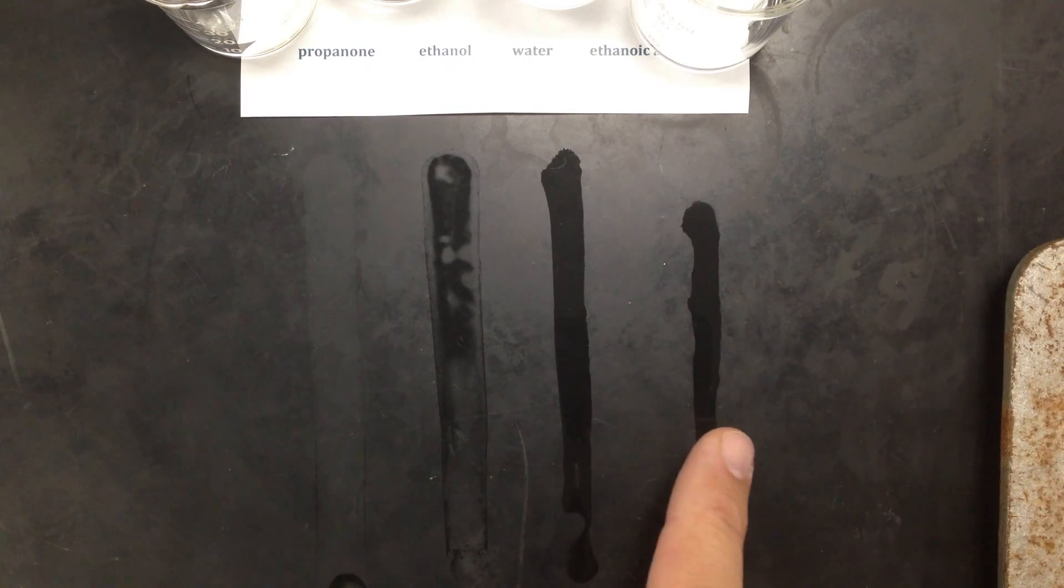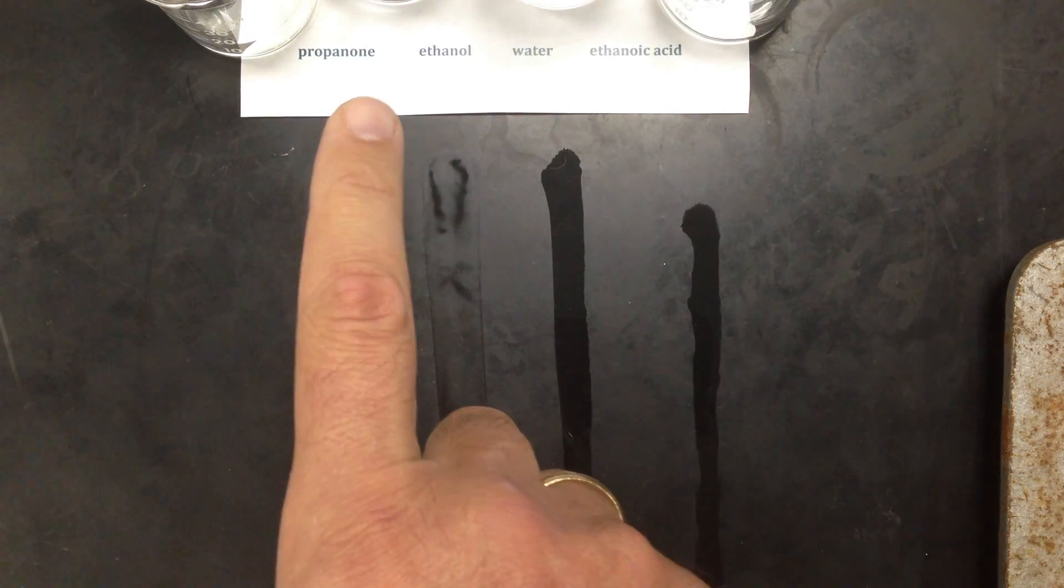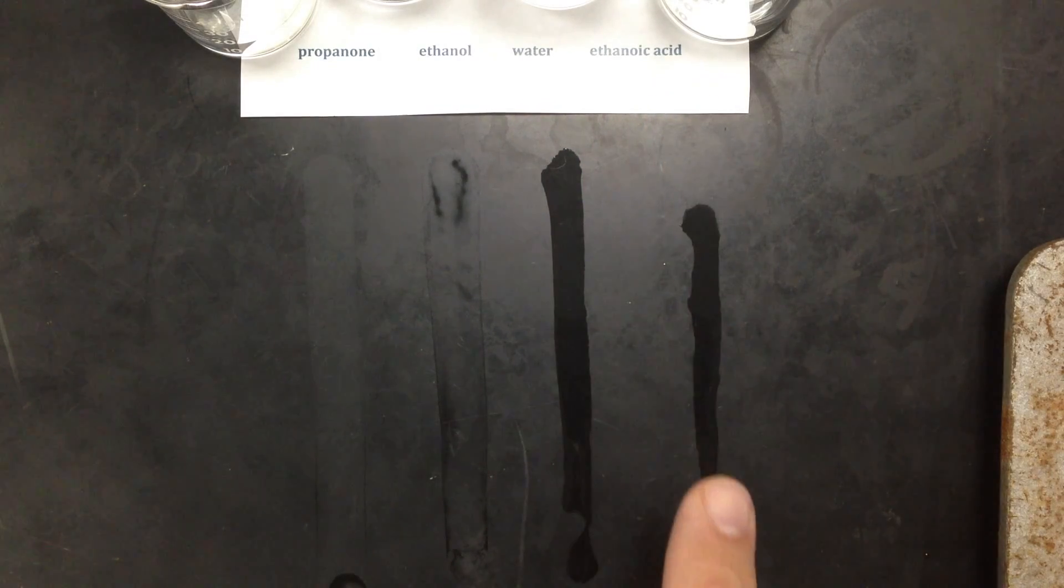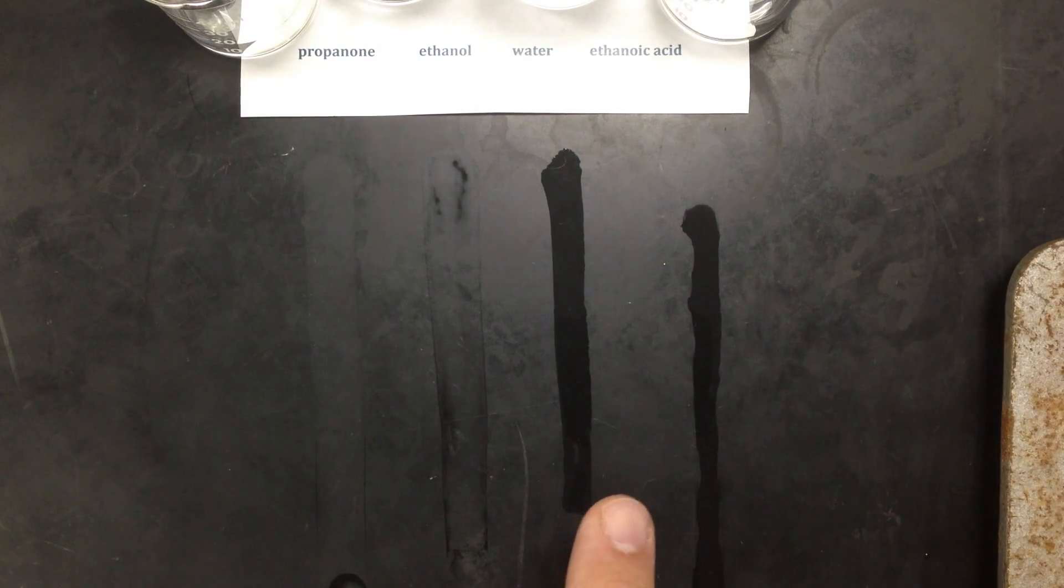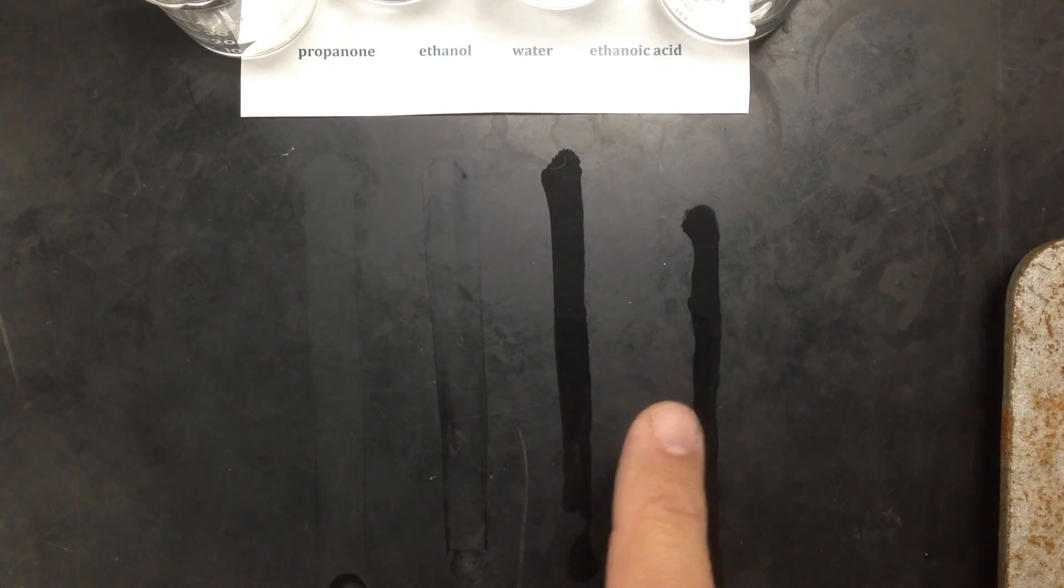And you can see that the ethanoic acid, that's the last line here, is actually beading up a lot more than the water. So we can say the attractive forces are increasing as I go from propanone to ethanol to water to ethanoic acid. And if I let this video play longer, water would evaporate next and then the ethanoic acid.